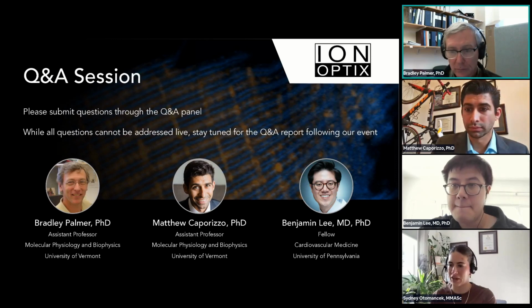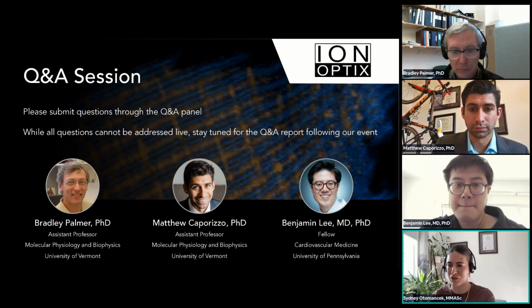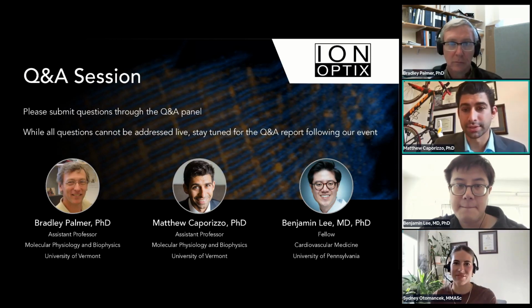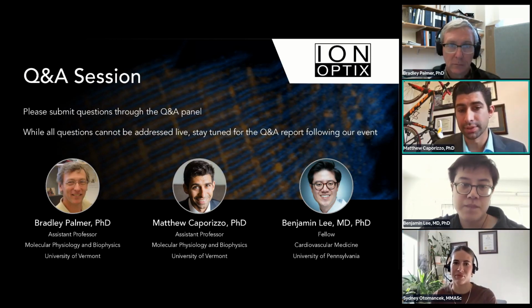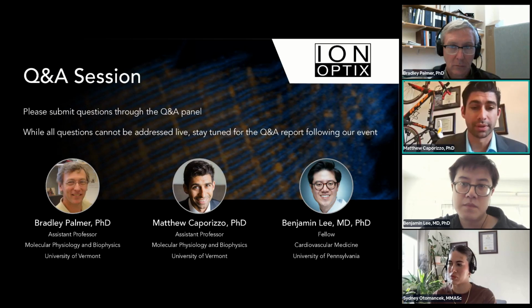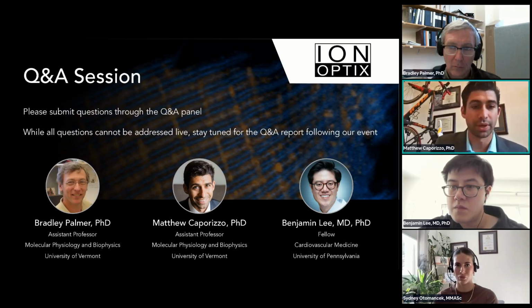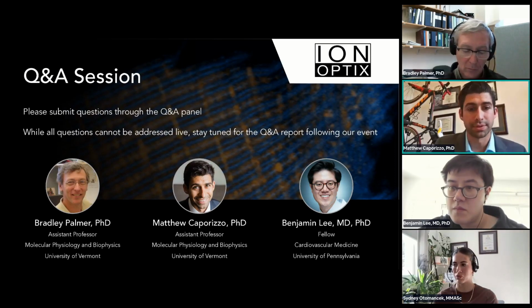Fantastic. Anything else to add from the other two? I might just add that there are some practical considerations too, in terms of how you keep the tissue: it might need to be continuously oxygenated, and you might want to pace it, and some of these groups have developed strategies to work around this. So while it is doable, it could definitely be improved and is going to become more of a regular approach that's used.